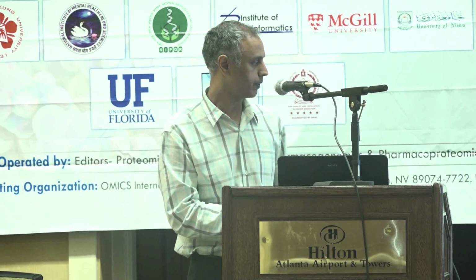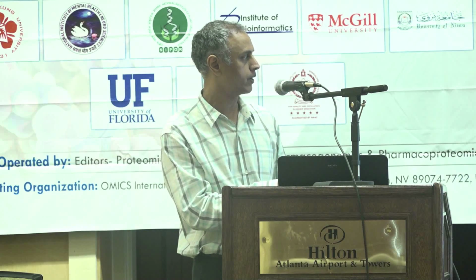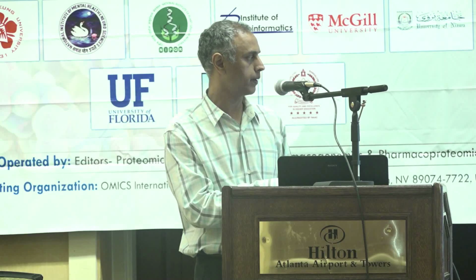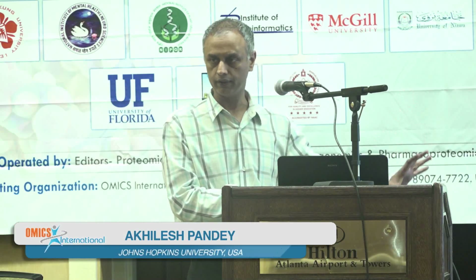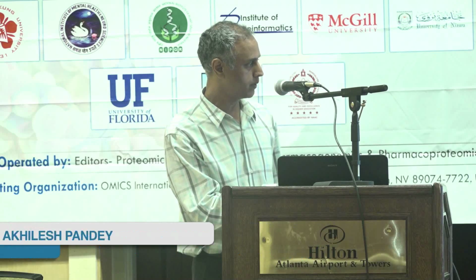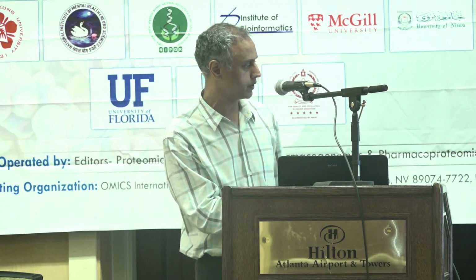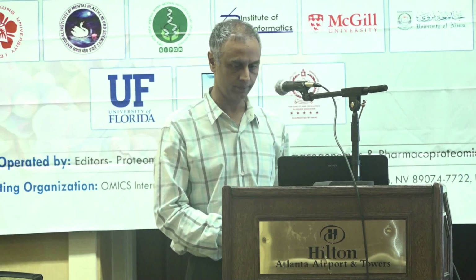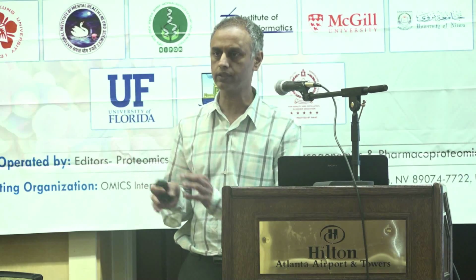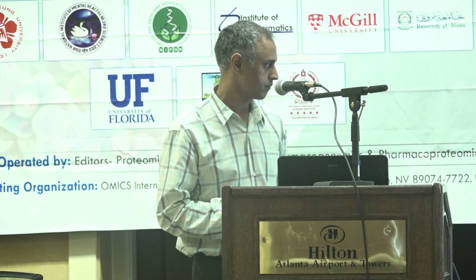So from our collaborators at Johns Hopkins, we got this list of samples where we had one which was carbapenem susceptible, we had a clinical isolate, and we had others given by the CDC, Centers for Disease Control, which are known to be KPC 3 positive, KPC 2 positive, VIM positive, NDM1, and OXA positive. And our goal was to use next-gen sequencing and mass spectrometry to try to tell them apart.